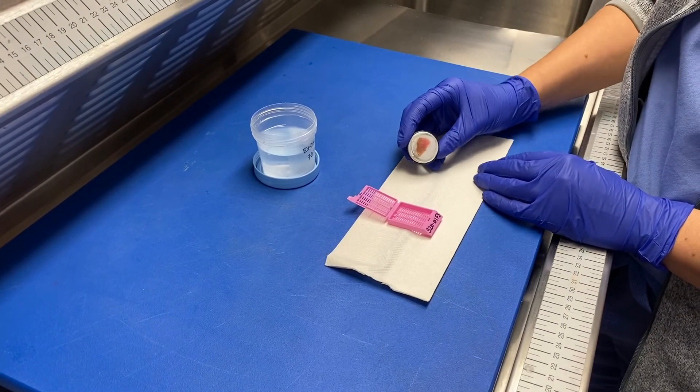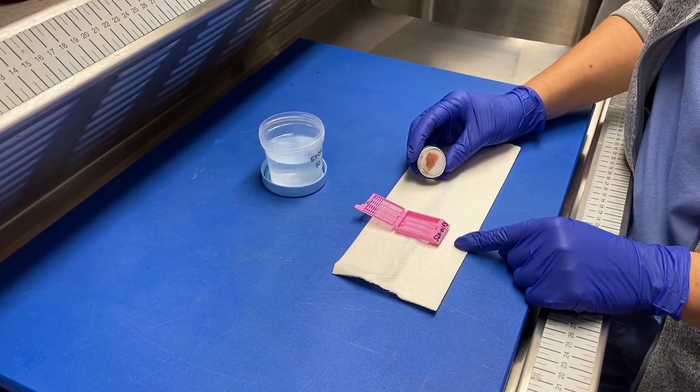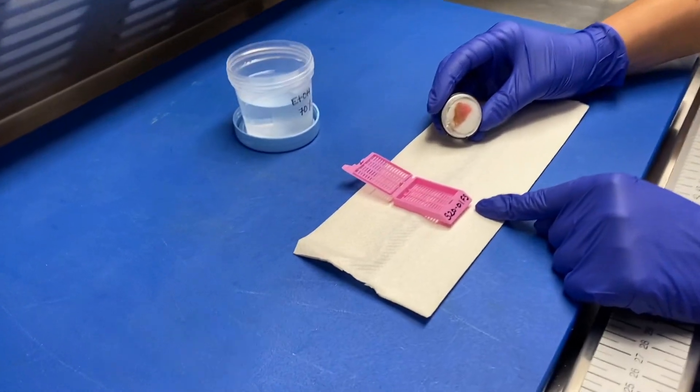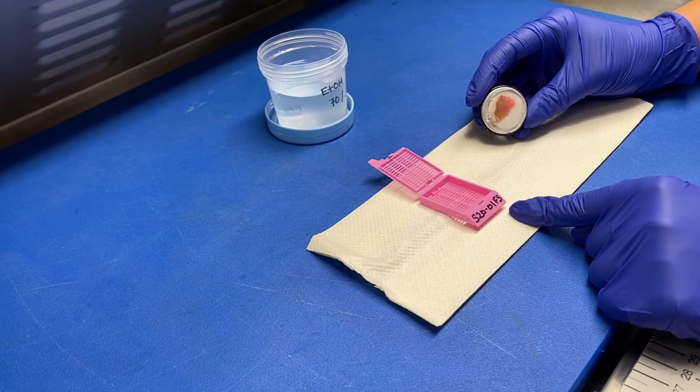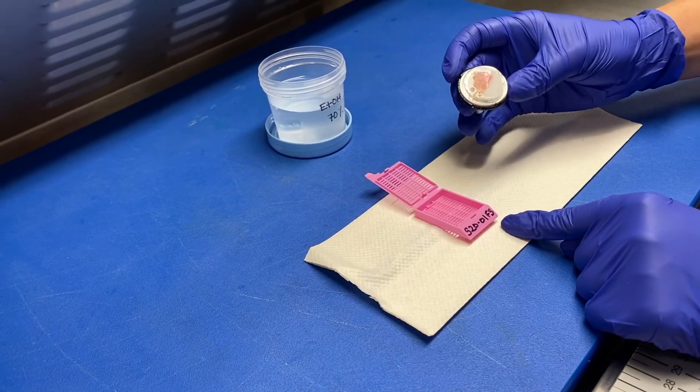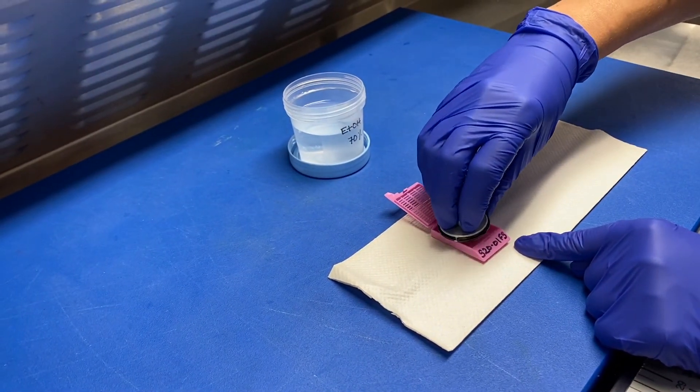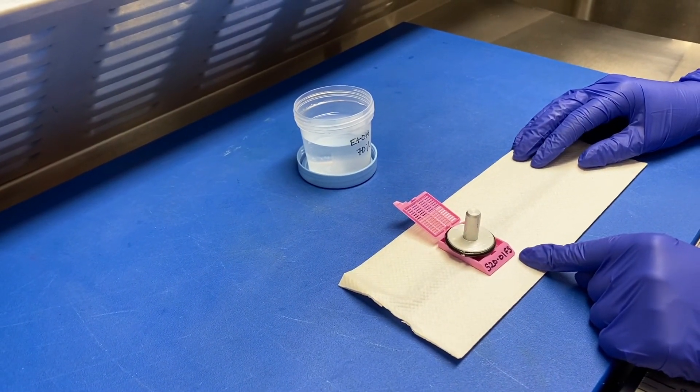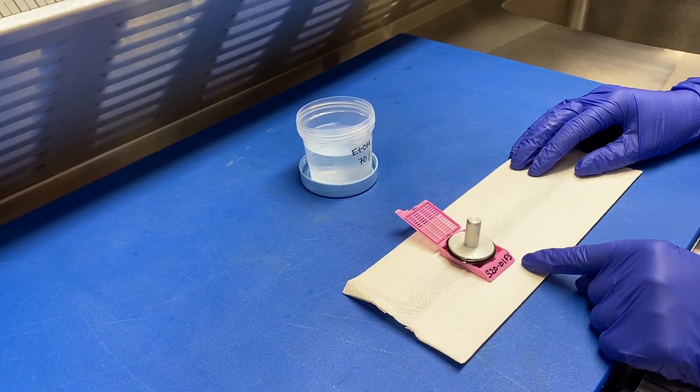After the frozen section is complete, we're always going to label our cassette and indicate by the letters FS that this is the frozen section remnant. The easiest way to do this is to place the chuck in the labeled cassette and let it come to room temperature so that the OCT melts away from the chuck itself.